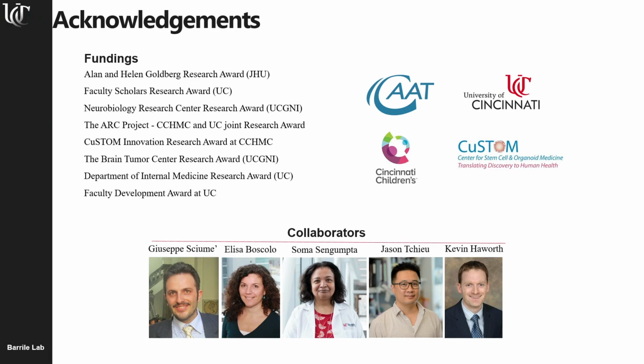Thank you very much. Question: did you use cells in the bioink to print them, or did you just print chips, in which case this is 3D printing and not 3D bioprinting? Can you clarify? Oh, good question. We do both, depending on the stage.